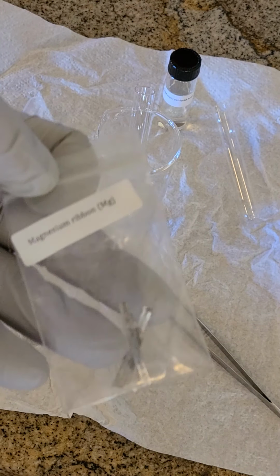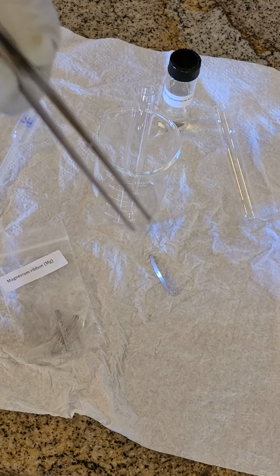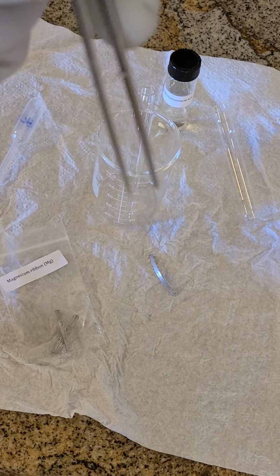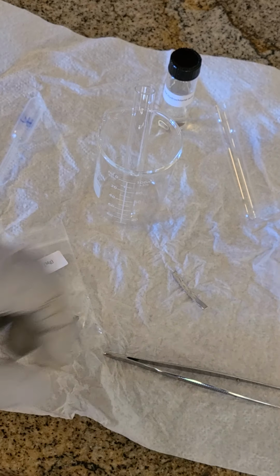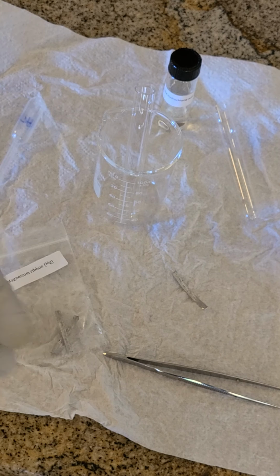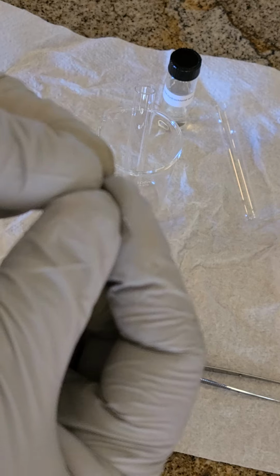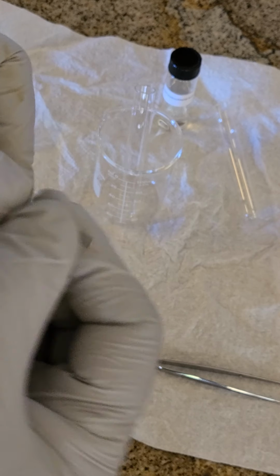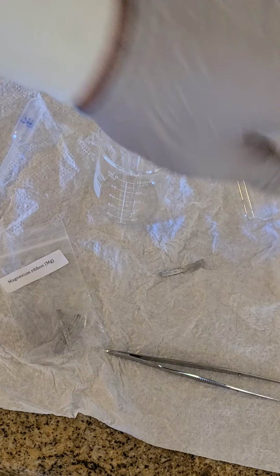You're going to need your magnesium ribbons, the magnesium strips that were provided. Get forceps. I mean, you could just grab it with your gloves, but you can get forceps and grab. What I want you to do is grab one magnesium ribbon for this particular reaction. Now, if we were in lab, I would tell you to sand the magnesium ribbon to remove the oxide layer so that the reaction is cleaner. You're not in lab. If you don't have sandpaper, don't worry about it. If you do have sandpaper, you can fold it over the ribbon and rub off that oxide layer. If you don't, no big deal.